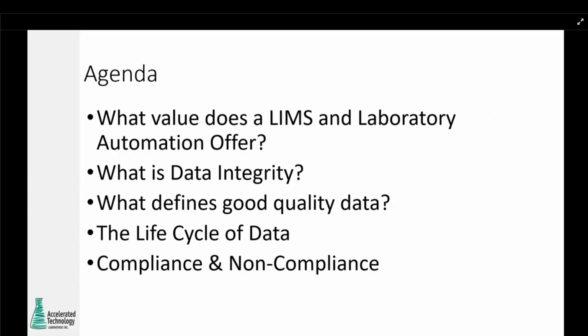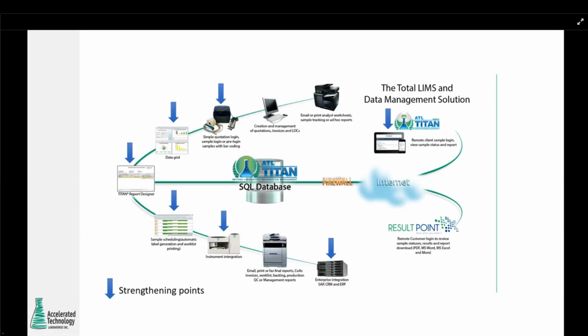Okay, let's take a quick look at our agenda for today. We're going to discuss what value a LIMS offers the laboratory along with automation. What is data integrity? What defines good data quality? We'll look at the life cycle of data and then also compliance and non-compliance, and we'll also take a look at a few case studies.